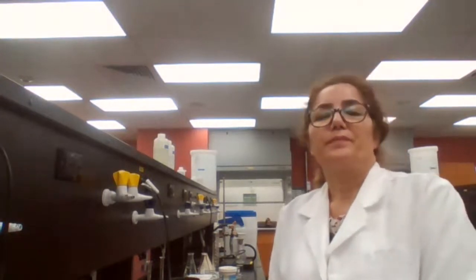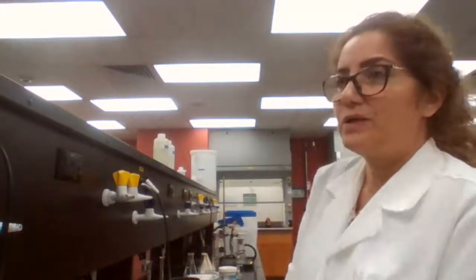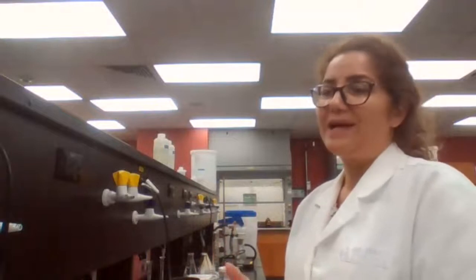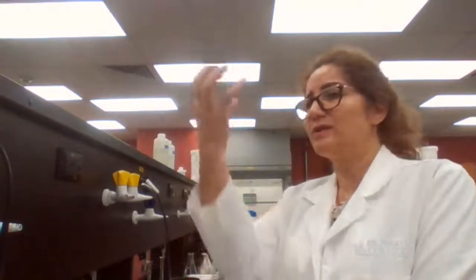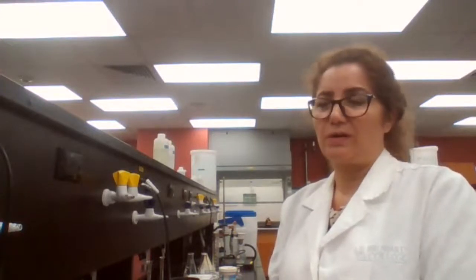Very good. If you do a sudden cooling, you take your sample from the hot water bath or hot plate, when it dissolves, and you place it right away inside an ice bath, basically precipitation will take place. Your solid is going to precipitate all of a sudden, and at the same time that it's coming down, it can also bring impurities down. So you would get impurities trapped within your sample. So you're not going to get pure product.